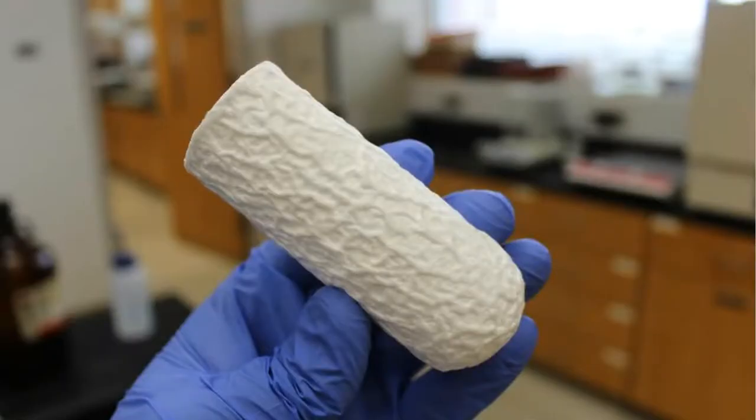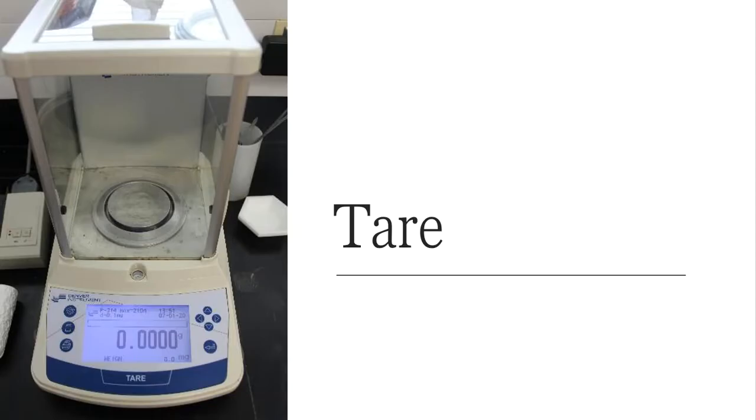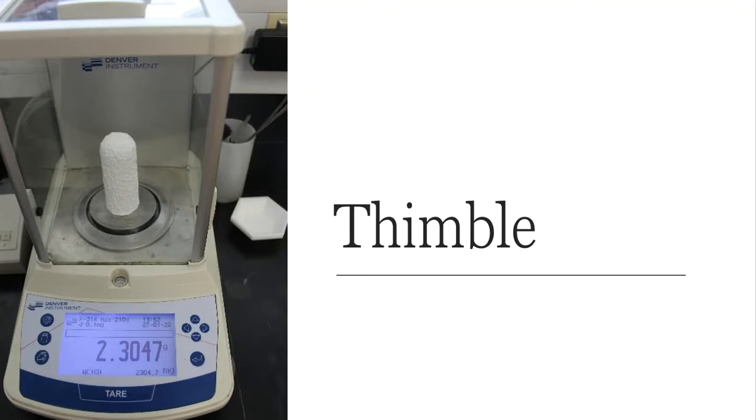So this is what the side of the thimble looks like. It is very porous. Think of it almost like a piece of filter paper. And then here's the inside of the thimble looking down from the top. So I need to go back to the balance. I'm going to tare it out once more. And now I'm just going to get the mass of the thimble only. That's all that's here, just the thimble, and that's 2.3047 grams.